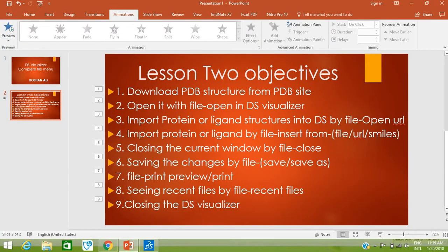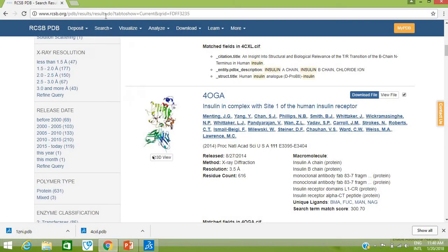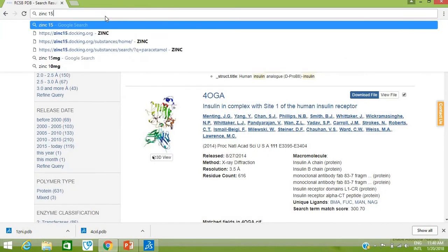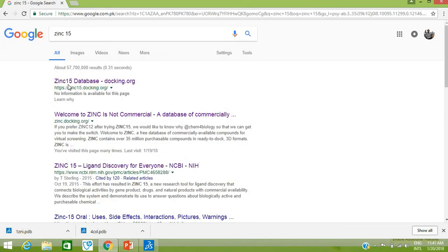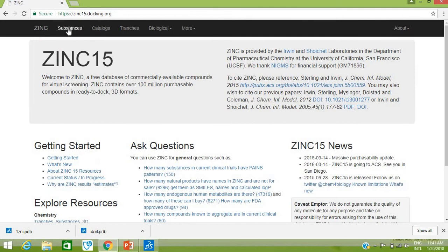Our next objective is to bring a drug structure or small organic molecule by its SMILES code. To find the SMILES code, go to the ZINC15 database. Type ZINC15 database in the browser, click on it, and go to Substances.